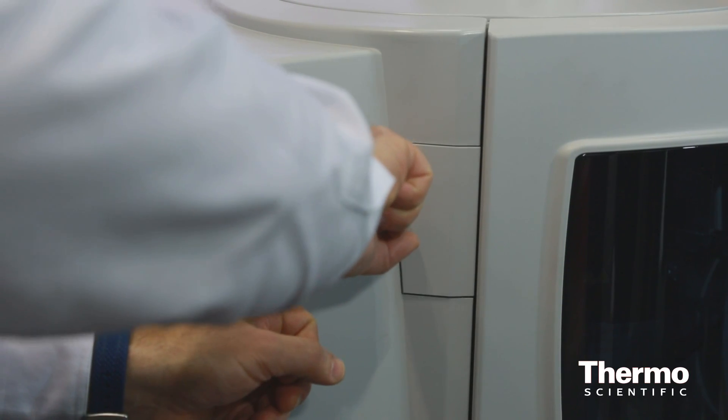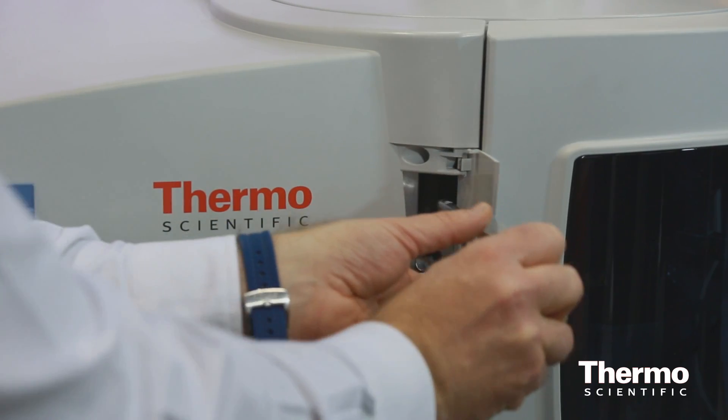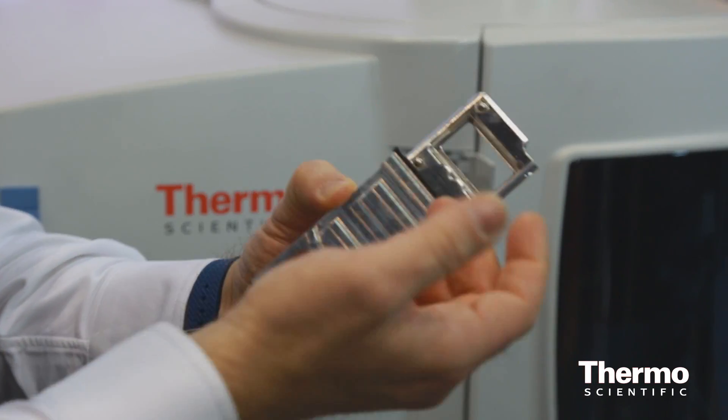There's also a wonderful feature where the window into the spectrometer might need cleaning every now and then. On another design you would dismantle the whole system to get at that. On this system, you can just pull it out of the front of the instrument on a cartridge in a couple of seconds and shove it back in when ready.